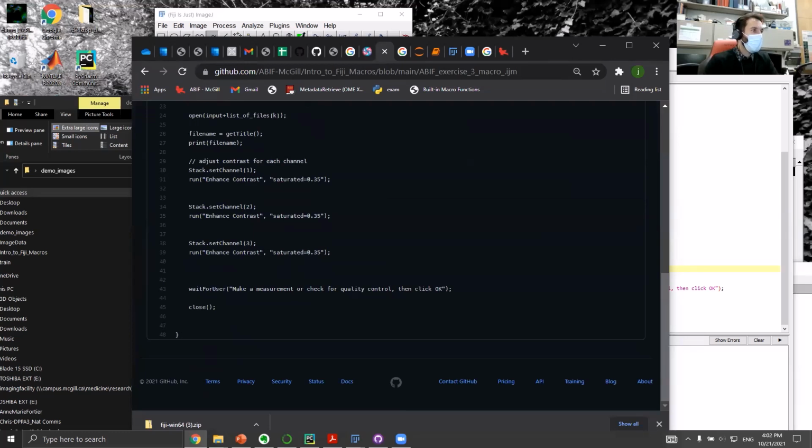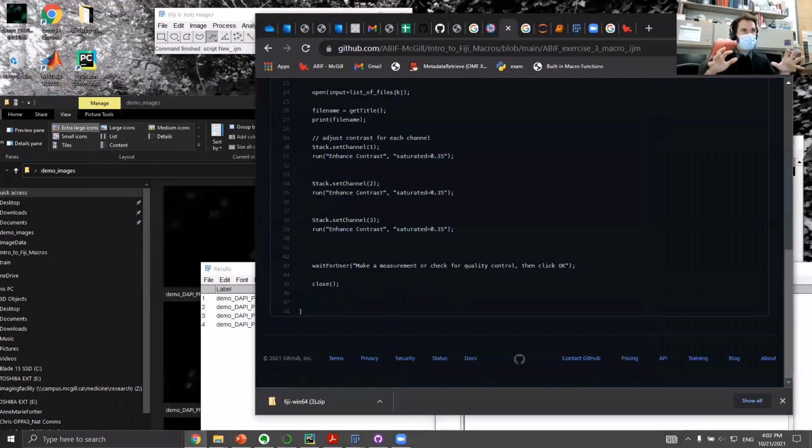All right, so I will stop there. It has been 2 hours. For some of you, this was super introductory. I'd be curious to know if you do have experience writing either in other languages or in Fiji, and I know some of you have. I've seen you. Let me know what you think about this, if this is how you would have taught it differently, or there are glaring things that are missing. For those of you that are a little bit more new to this, please give it a shot.